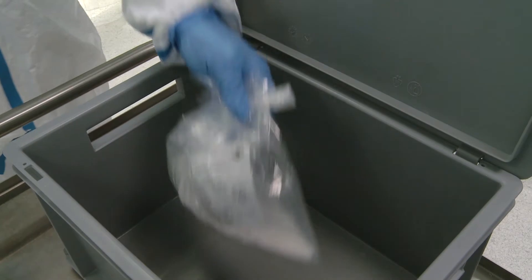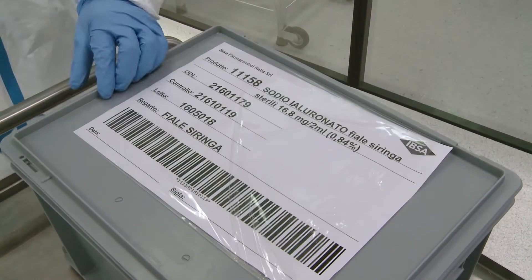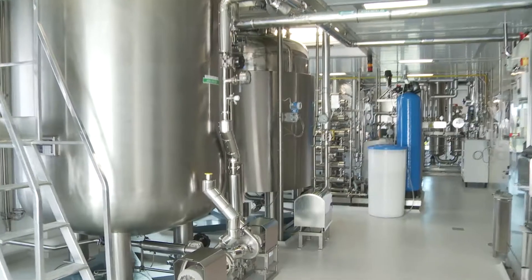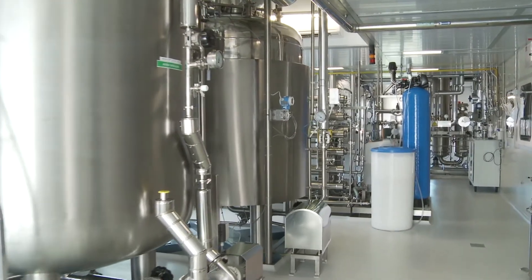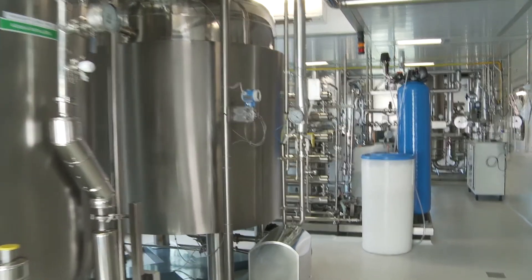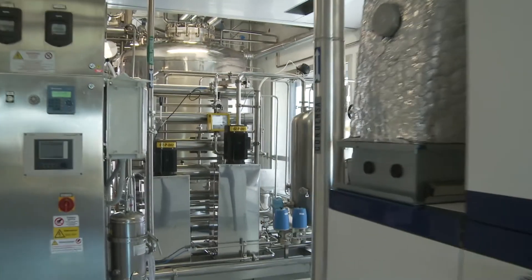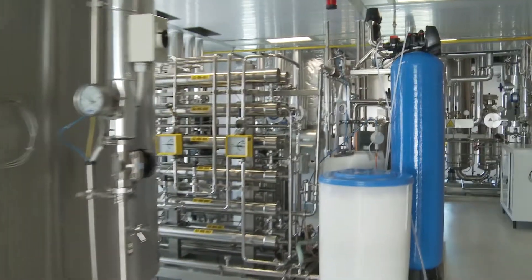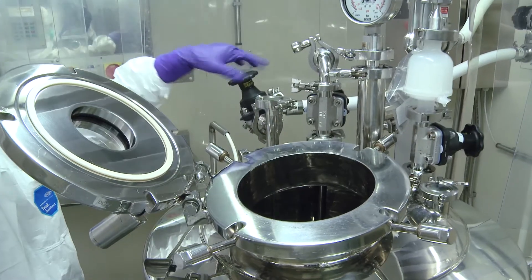The hyaluronic acid is highly purified by removing proteins and cellular debris. It is also certified as GMO-free. The high molecular weight that characterizes Gelsin-3 hyaluronic acid is between 1400 and 2100 kilodalton. The preparation tank is filled with highly purified water.